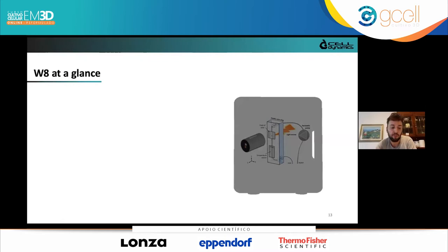It takes images and converts the fall speed into mass density based on a physical law. The software is also able to measure the size and in the end also calculate the weight. So we have three outputs. The device is calibrated in terms of accuracy and precision with polystyrene beads as you do in flow cytometry.